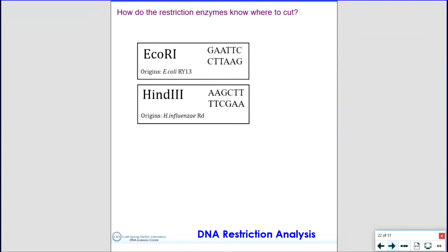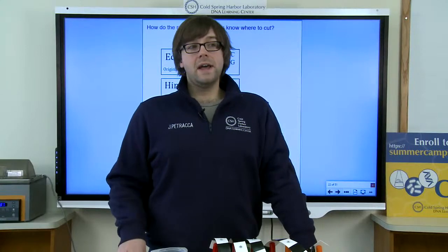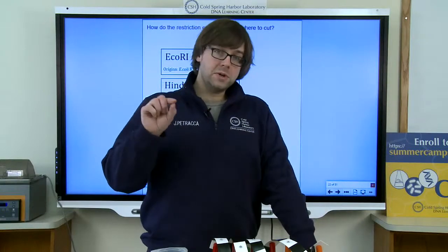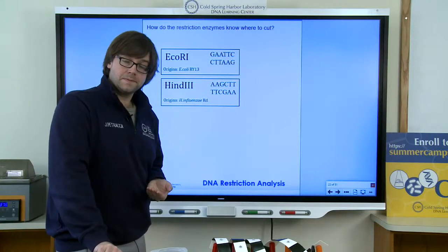For today's experiment, we're going to be talking about two different restriction enzymes. Whenever we do a lab here at the DNA Learning Center, I always like to emphasize what the purpose of the day is supposed to be. If you're following along at home and carrying out the experiment, or you're going to be coming here in the future, always remember that when you come here to do a restriction analysis, the whole purpose of today's lab is to identify a mystery restriction enzyme. We basically have a tube that has a question mark on it that is one of these restriction enzymes, but we don't know which one it is.